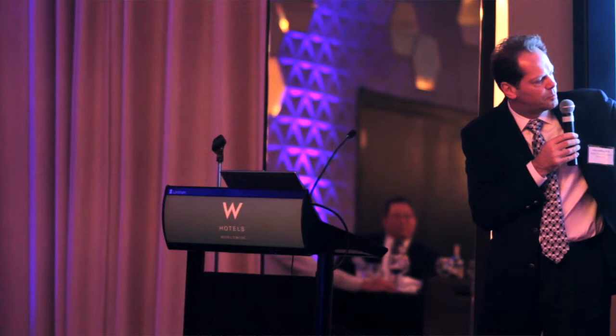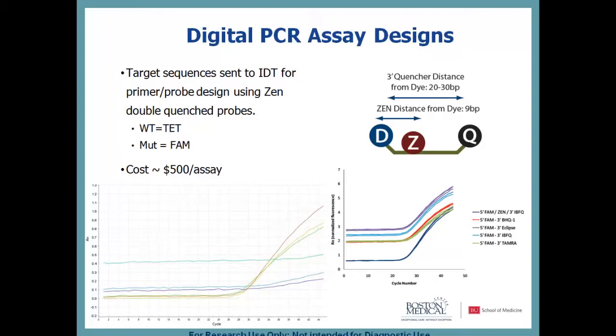We didn't see the low-background performance shown in the IDT spec sheets when we ran our probes. Of the wild-type probes, three looked okay — very much like the published data — but one had high background and very little signal, and two others had low background but still very little signal. It was even worse when we went to the mutant probes: only one of them looked good.